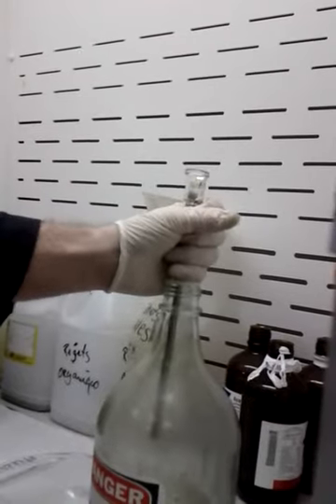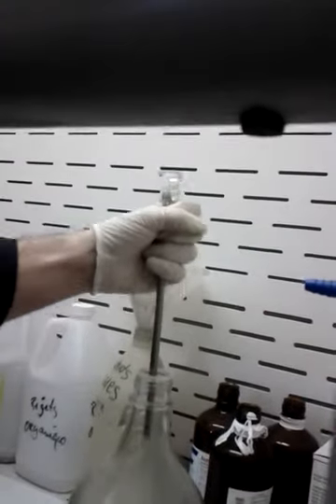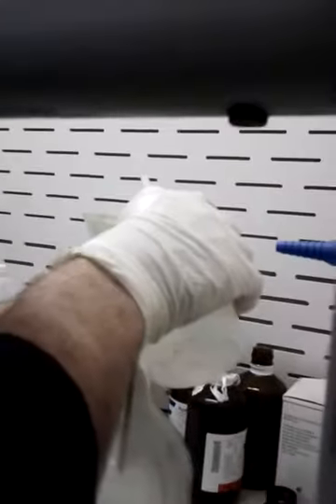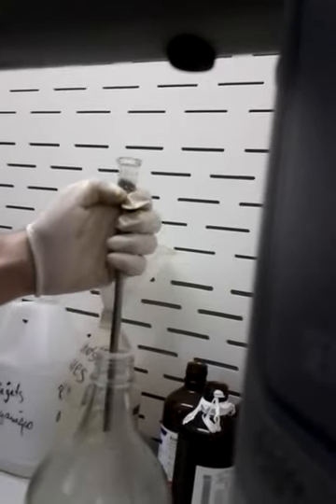So this is typical. We always have a bubble here. And what we can do to remove it, usually I put some water there to try to remove the mercury.